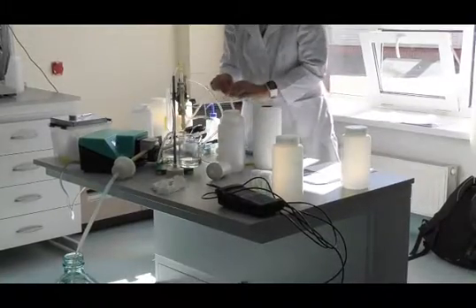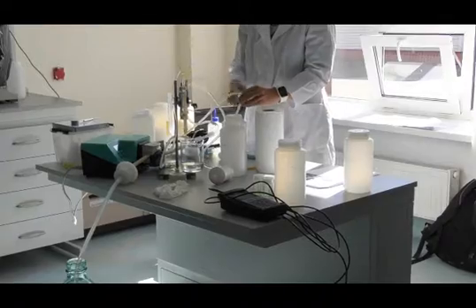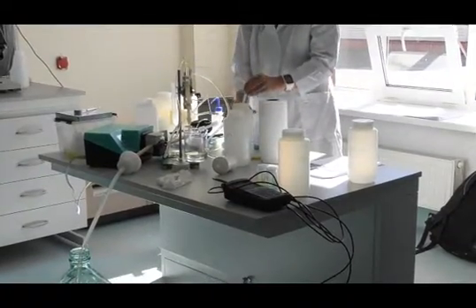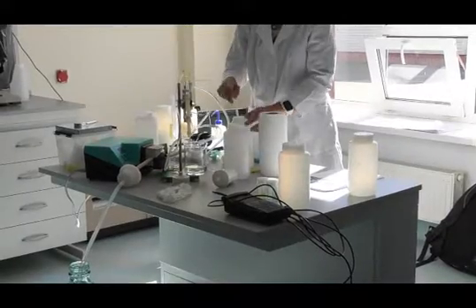It just protects the pump from damage or something. But if I am to take a big sample of this one, I will disconnect here maybe. But you don't have to do it.